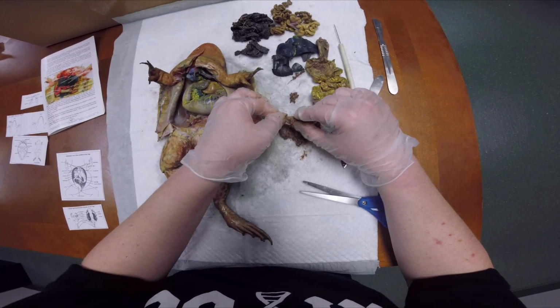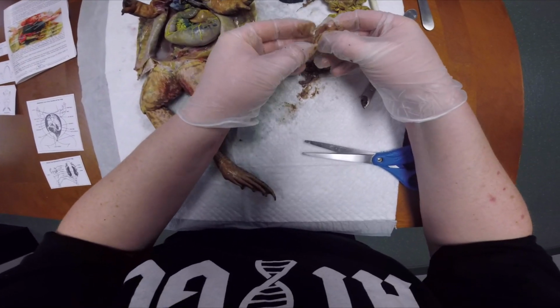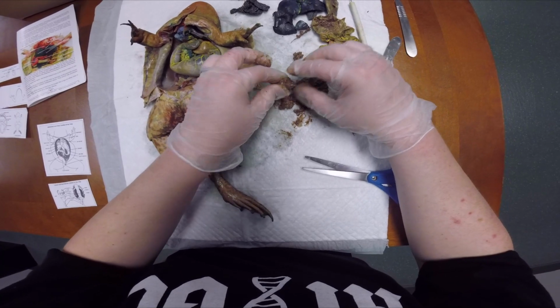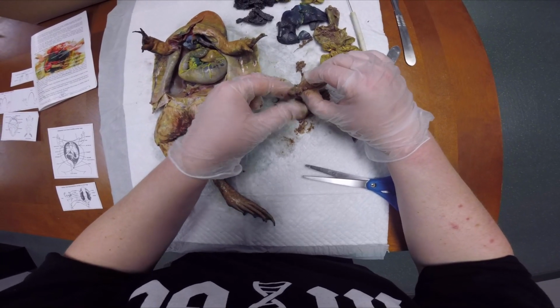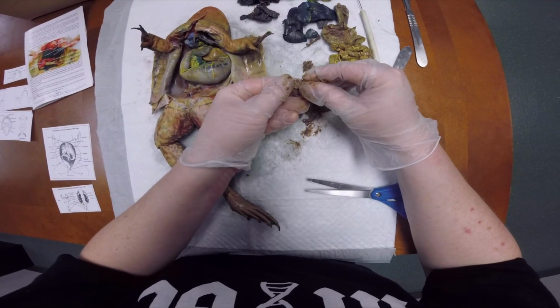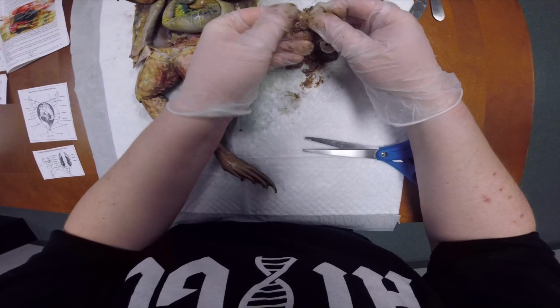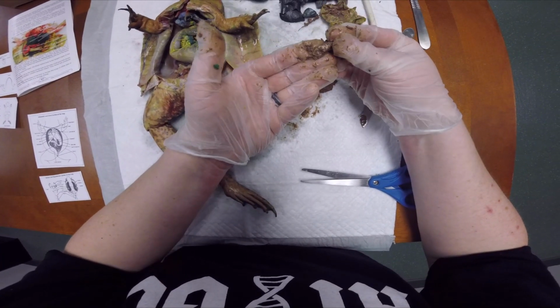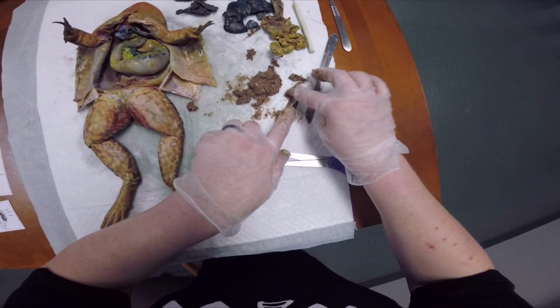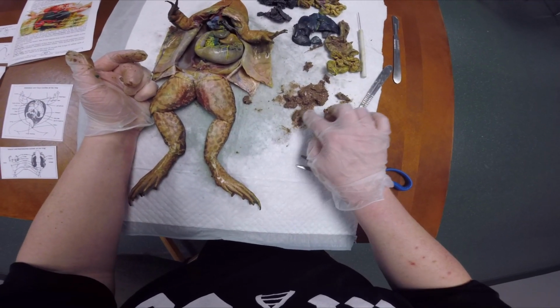Yes. All right, here's a crawfish claw. Delicious. Looks like it didn't digest very well. And looks like a shell, a snail shell or something. Not a seashell because they don't live by the sea, but it looks like it was eating a snail. Yum. Delicious. So obviously you can see that part didn't digest very well. Here's a leg of some sort.